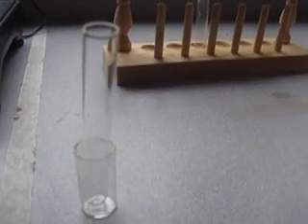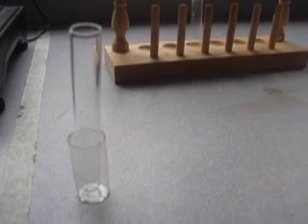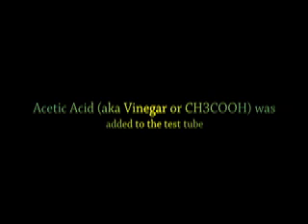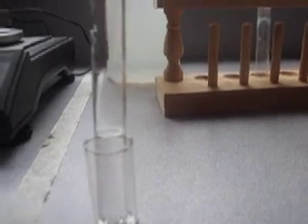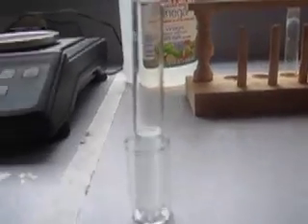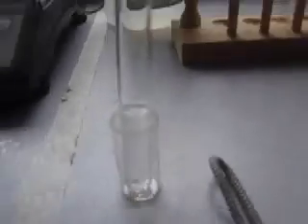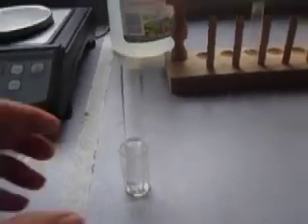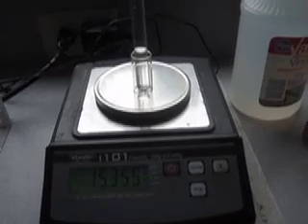Next we will take this test tube holder and test tube and add some acetic acid, also known as distilled vinegar. We now have 4% vinegar in this test tube — you can look down into the tube and there is vinegar in there. We will now weigh the test tube, test tube holder, and vinegar. We now have a total mass of 15.355 grams.